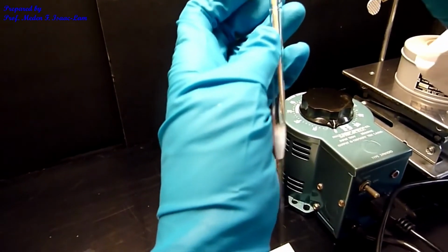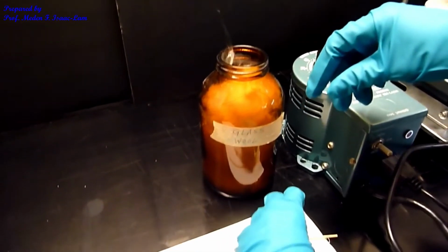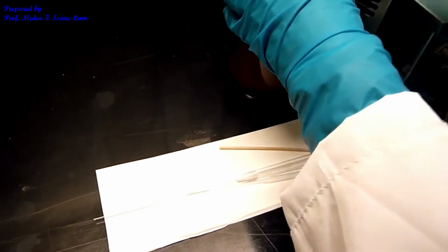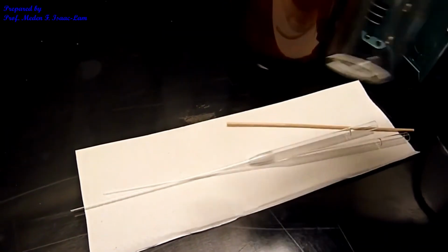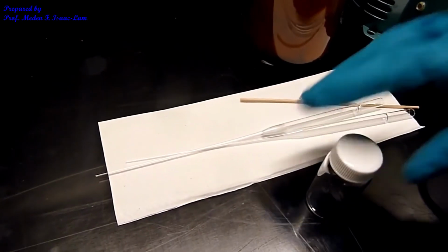So that's my filtration setup. And I also have a vial. So we'll filter through the vial.